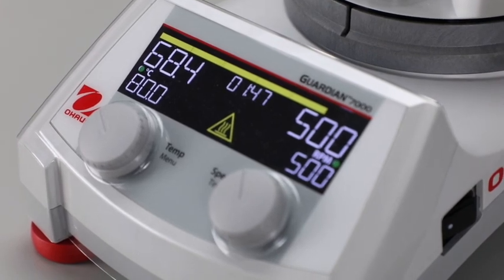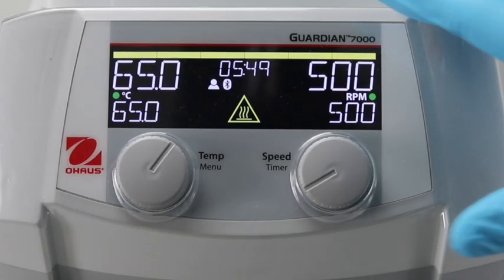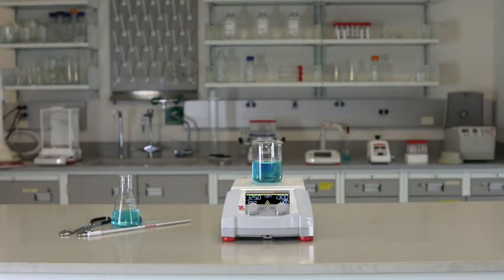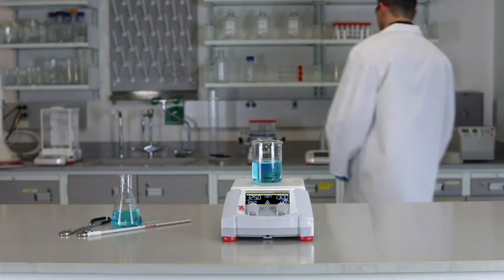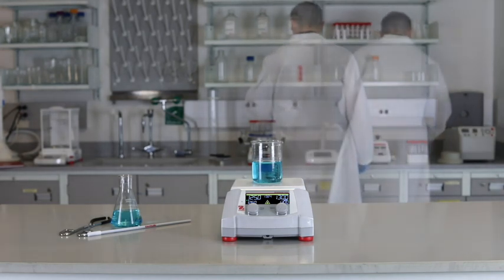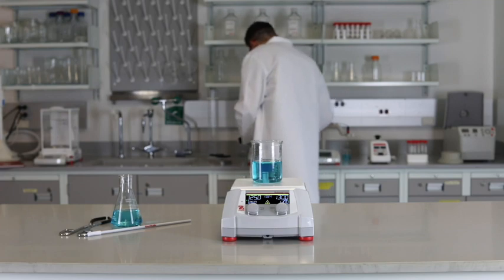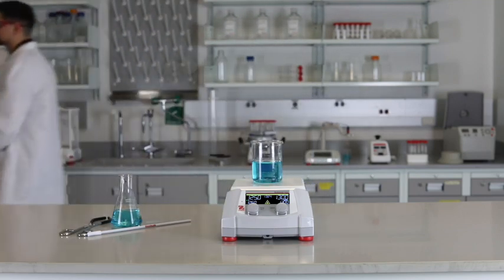Smart Presence and Smart Link technologies ensure supervised operation in the lab. Smart Presence utilizes an exclusive IR-based proximity sensor that recognizes a user nearby, and when no one is detected, safely turns off the heating function, ensuring supervised operation in your lab.